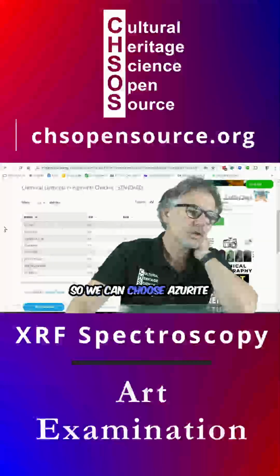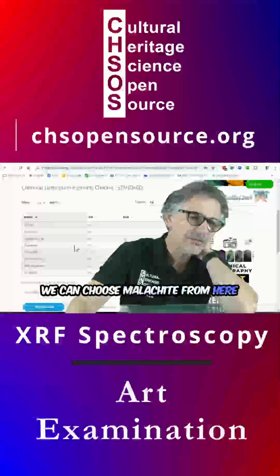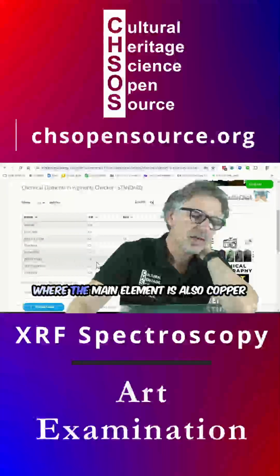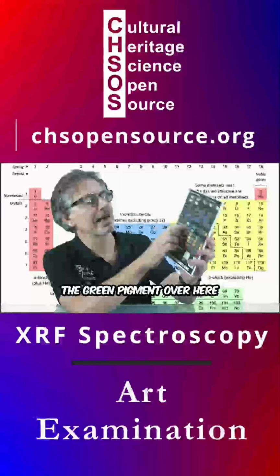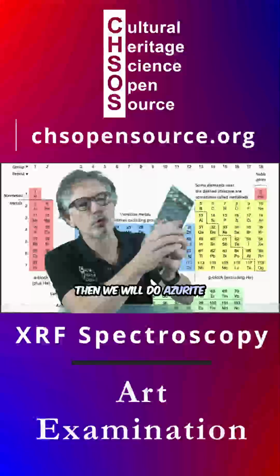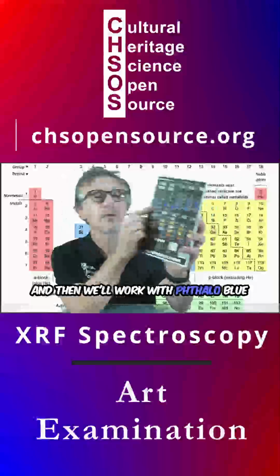So we can choose azurite, we can choose malachite, and from here I also want to choose phthalo blue, where the main element is also copper. We start with malachite, the green pigment over here, then we will do azurite, and then we'll work with phthalo blue.